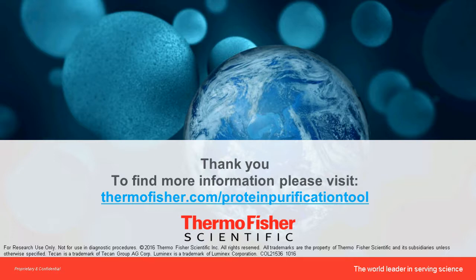Great, thanks, Bhavin. And our next question asks, are MS-based methods getting more and more popular due to their higher specificity? And the second part of the question is, what is the biggest obstacle to popularizing MS-based methods? Andreas, is that something that you can perhaps pick up on?